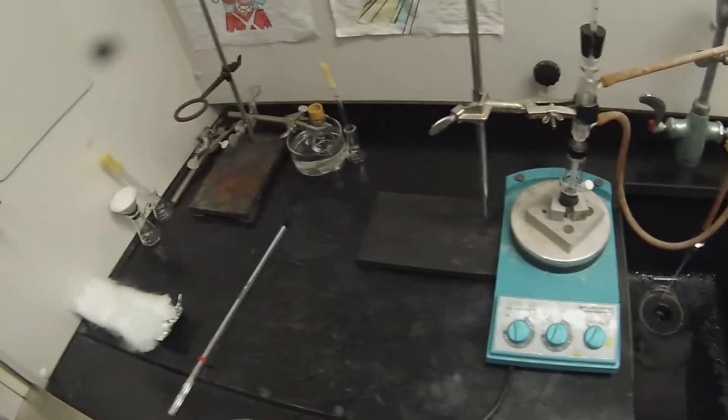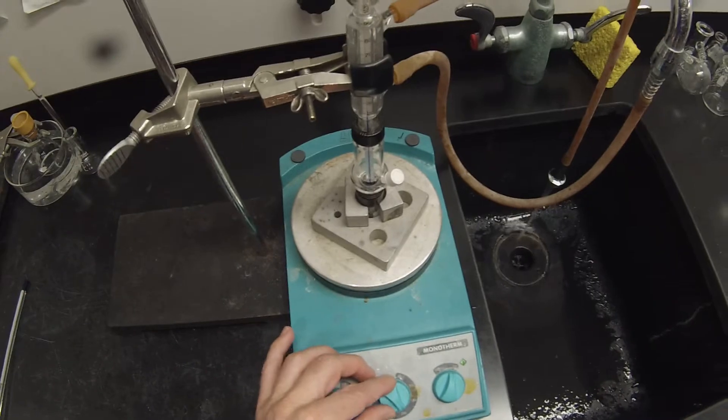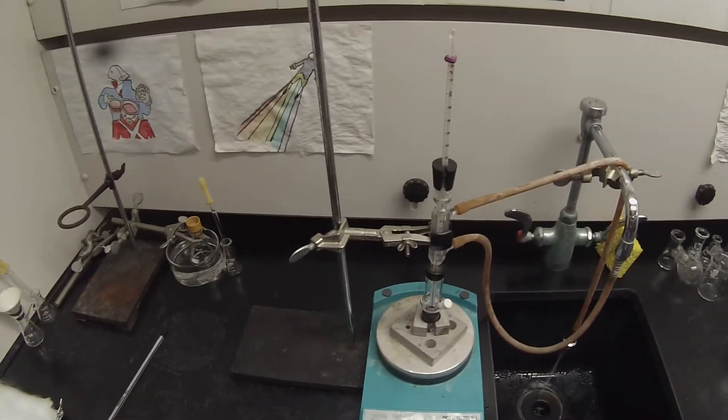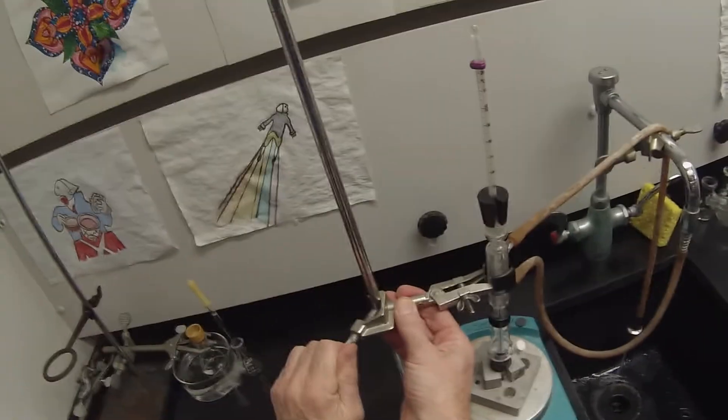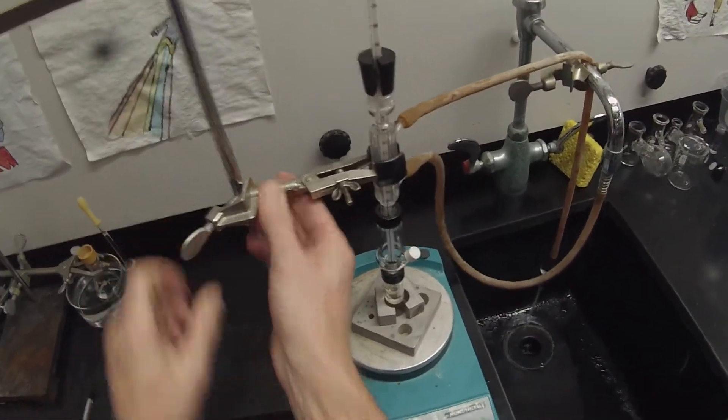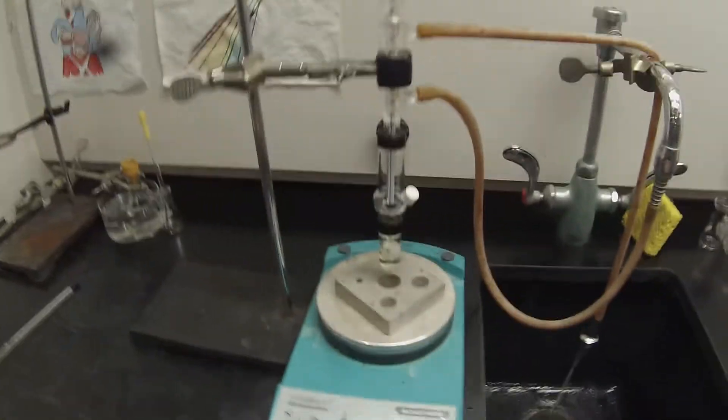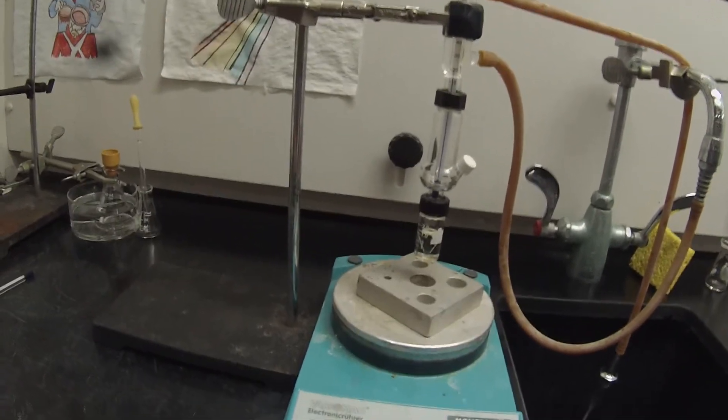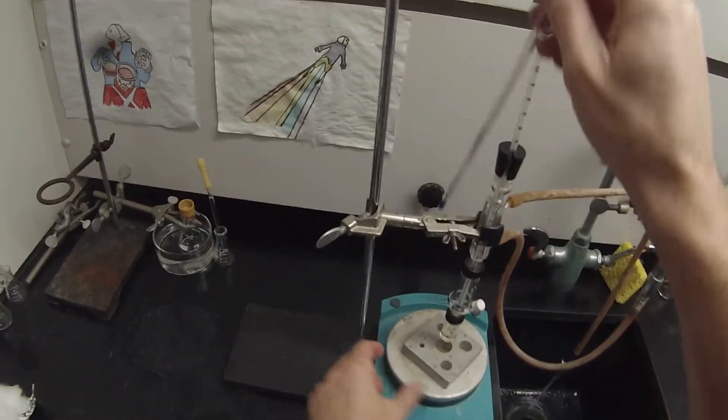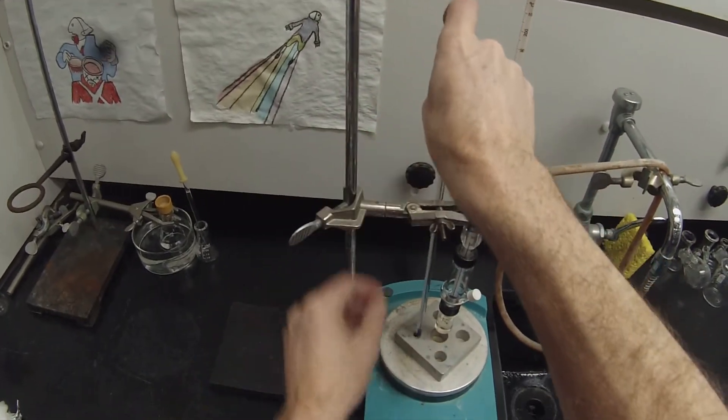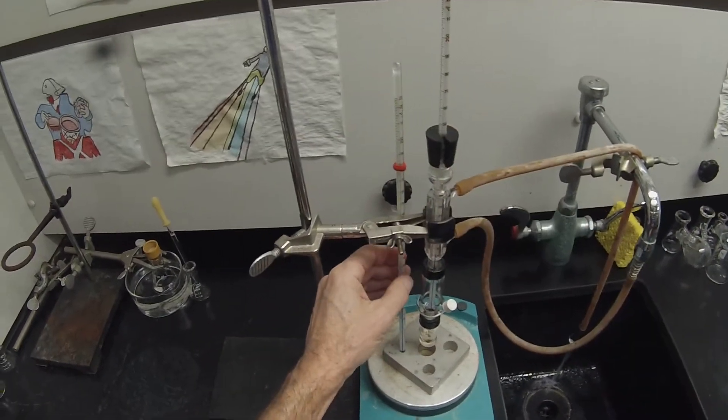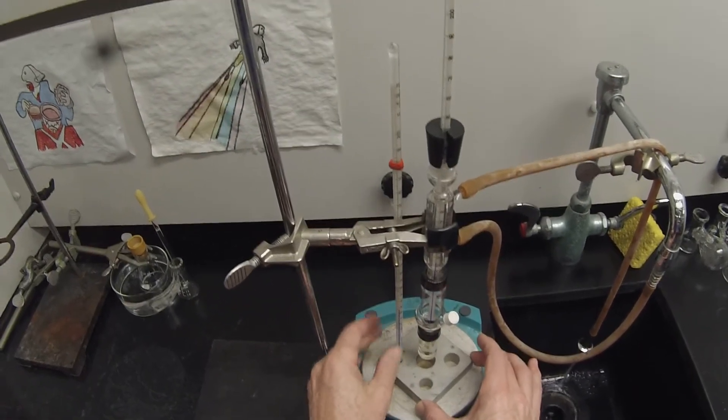Now we're going to turn that on and we want that hot block to be at about 180 degrees, so I'm going to turn this up to halfway between 200 and 250 to try to get that up to temperature fairly quickly. In the meantime I'm just going to scoot that out because we don't really want to heat it prematurely and risk dehydration reactions or other side reactions. We want it to distill pretty quickly once it distills. I'm going to stick a thermometer in that block so it's just behind the clamp so it's safe.